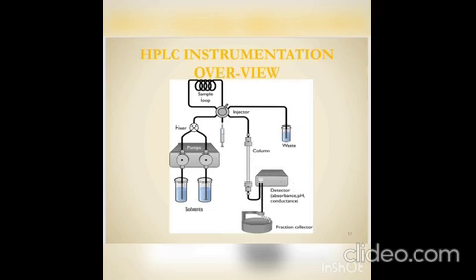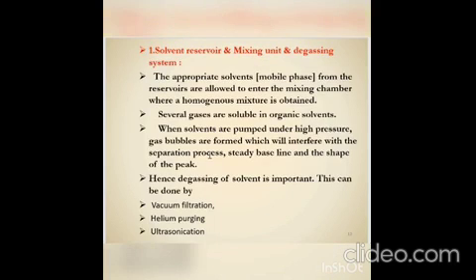First one is the solvent reservoir, mixing unit, and degassing system. In the solvent reservoir, the appropriate mobile phase is filled into the mobile phase bottles, and then pumped into the HPLC system using the pump. The mixing unit will mix the mobile phase based on the composition. The degassing system is needed because several gases are soluble in the organic solvents.